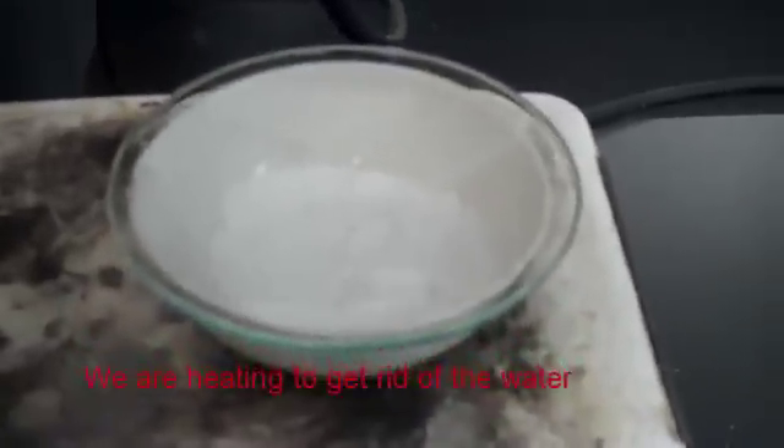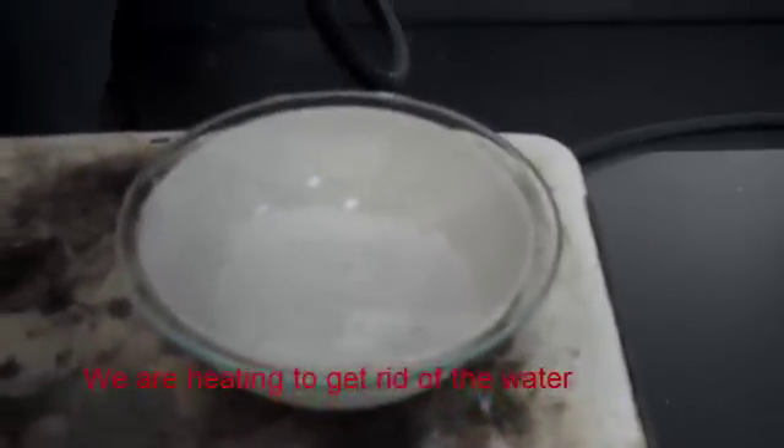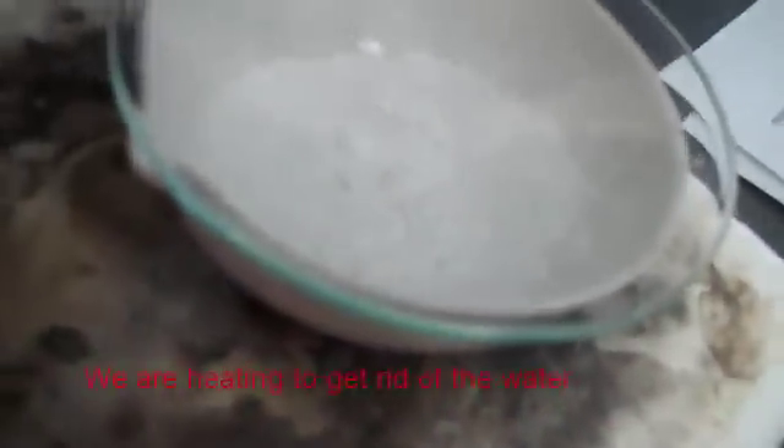Now gently heat the evaporating dish on your hot plate and avoid spatter. When all the liquid is gone, replace the watch glass on the evaporating dish, using small openings for vapor to escape. Heat gently again until no liquid remains.